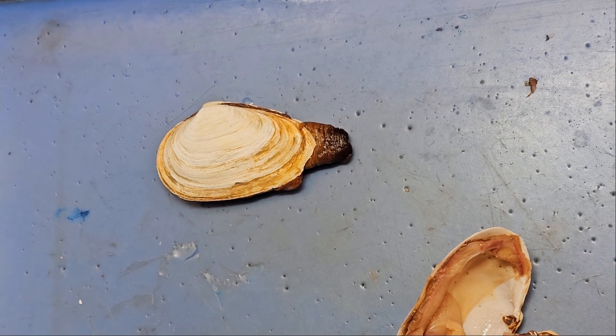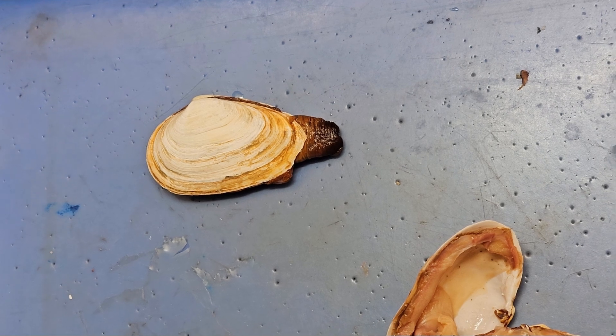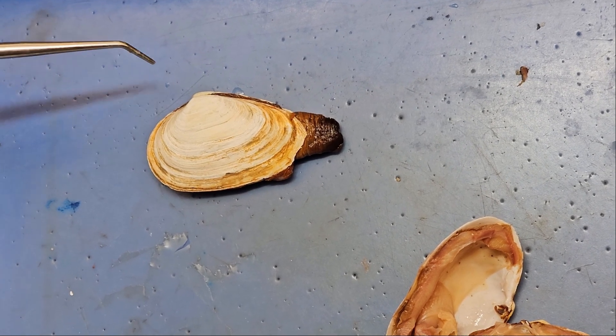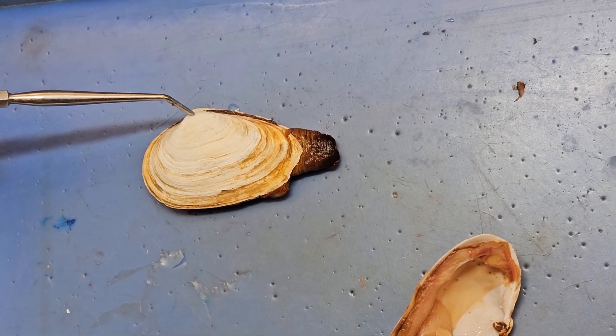Here we have a gooseneck clam dissection for my students at Golden West College in Huntington Beach, California. We're going to look at external anatomy first. Here we have the umbo — the umbo always points anterior.